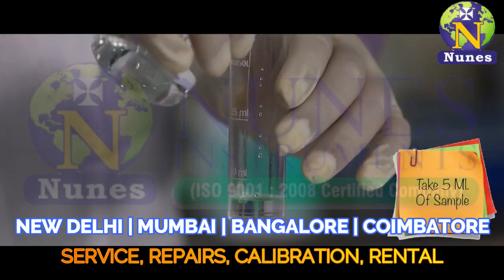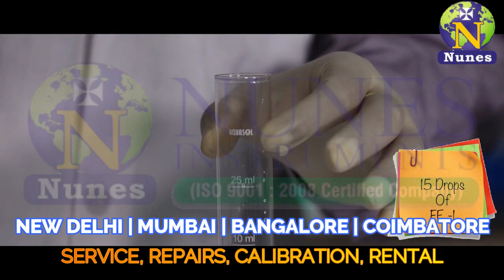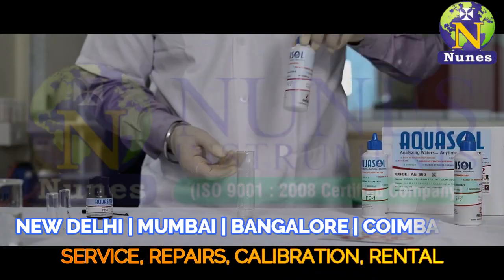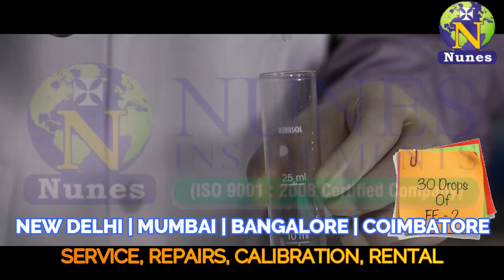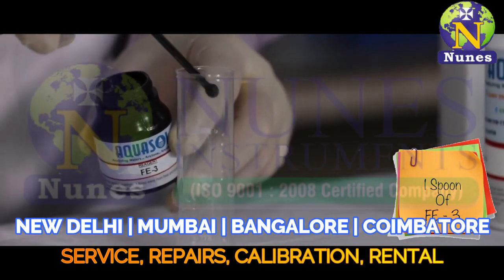Start the test by collecting 5 ml of sample. Add 15 drops of Fe1 reagent and 30 drops of Fe2 reagent. Then add 1 spoonful of Fe3 and mix well.